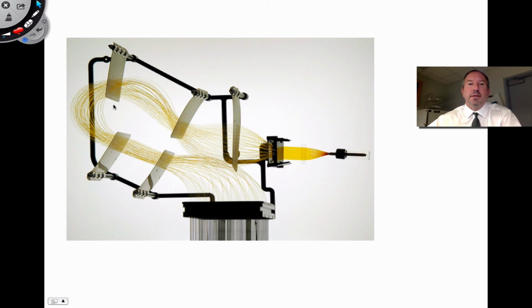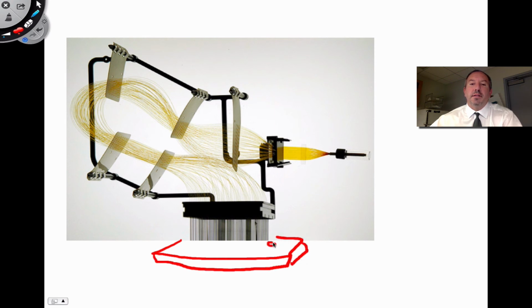It sort of looks like a big ship with these sails right here, just keeping the capillary tubes organized. But basically samples are drawn up from a well like this, you put a plate on this, and this is done automatically, and here you have your 96 plate, and all of your samples are in here.